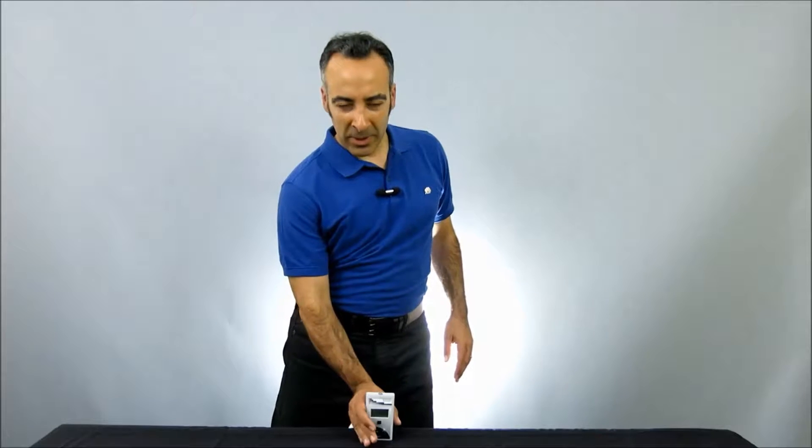Hi, I'm Moshe Levy, Vice President of Marketing at Solar Light. Today we're going to be taking a look at our solar meter model 7.5 radiometer with integral sensor. The 7.5 is an excellent erythema effective meter for extremely accurate instantaneous minimal erythema dose per hour measurements from both UV lamps and from sunlight.